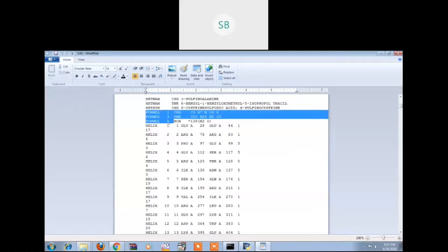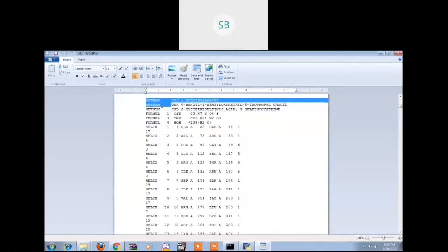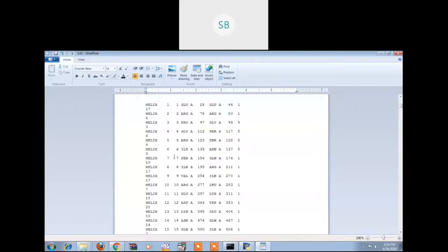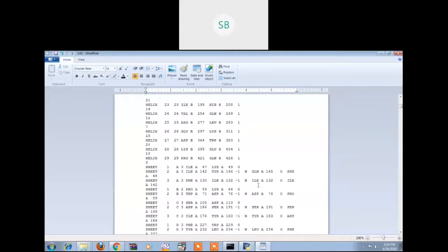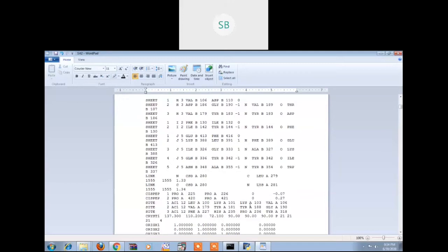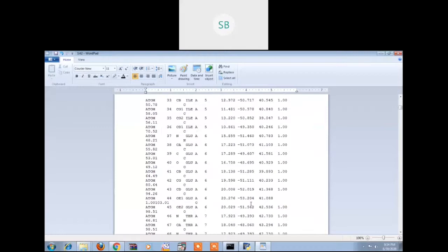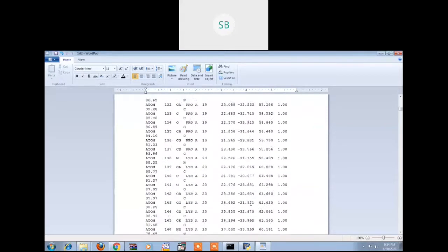So what you need to do is, see, as we found, these are the unwanted stuff for the time being. These are unwanted because this is the heteroatom or hetero name, right? So we'll just remove it. Just select and delete, same thing. Now if we just drop down, let us drop down because you need to check it thoroughly, right? It should be like a bird's eye view, right? You need to check it because you are in the search of what?